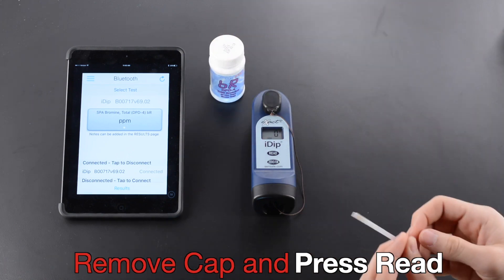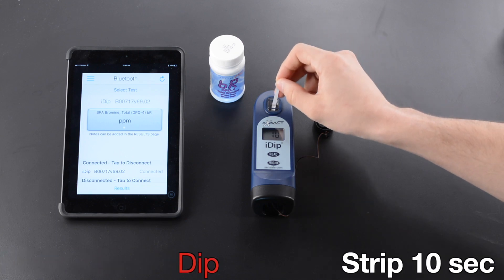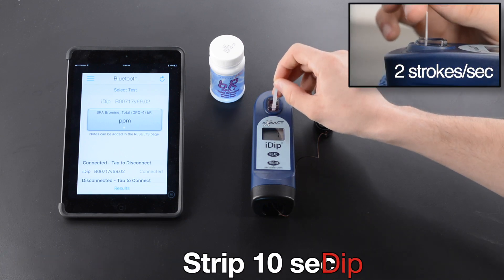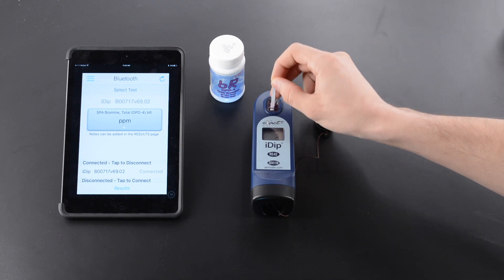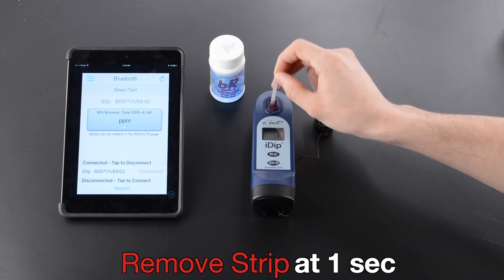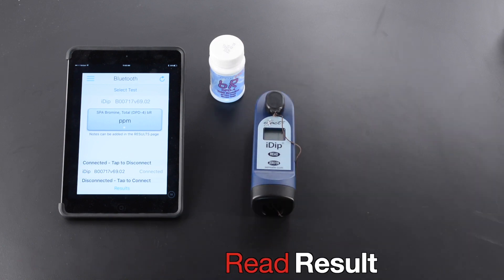Remove cap and press read. Dip strip. Ten seconds, two strokes per second. Remove strip at one second. Replace cap. Read result.